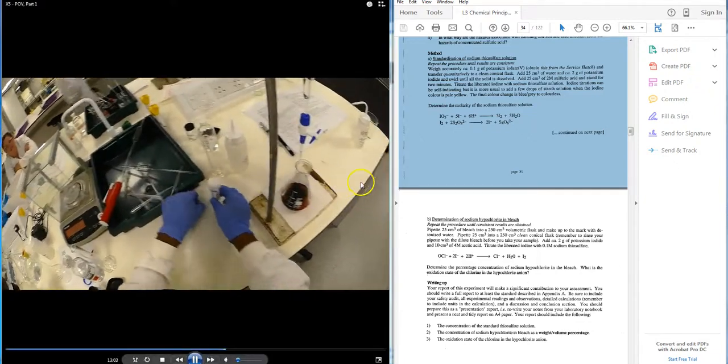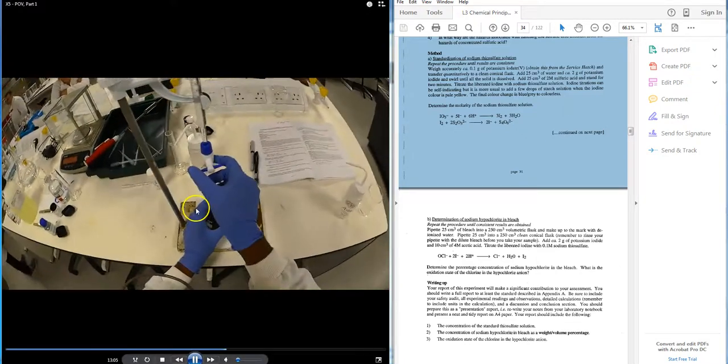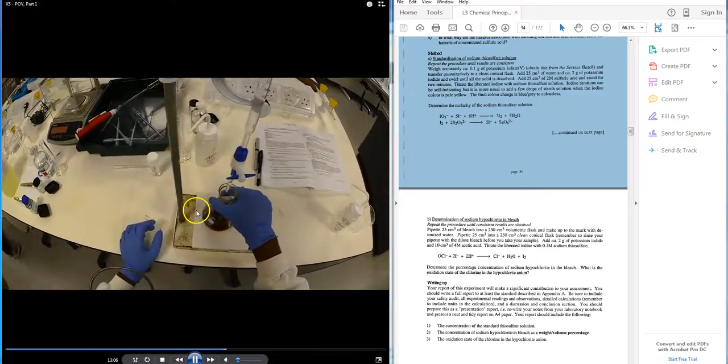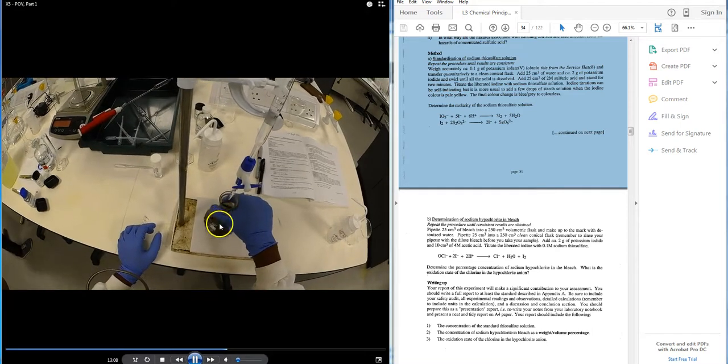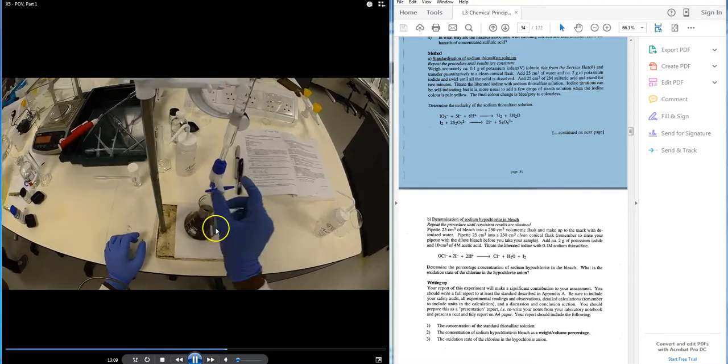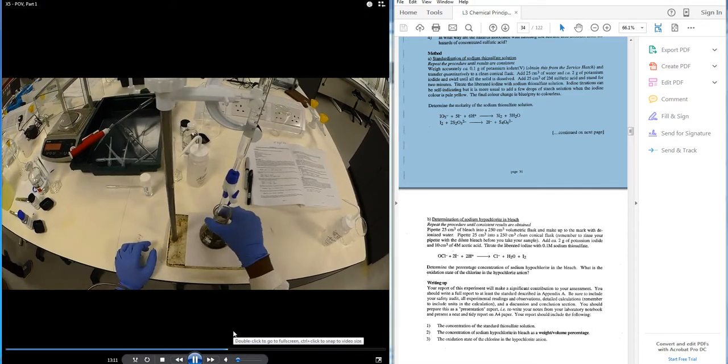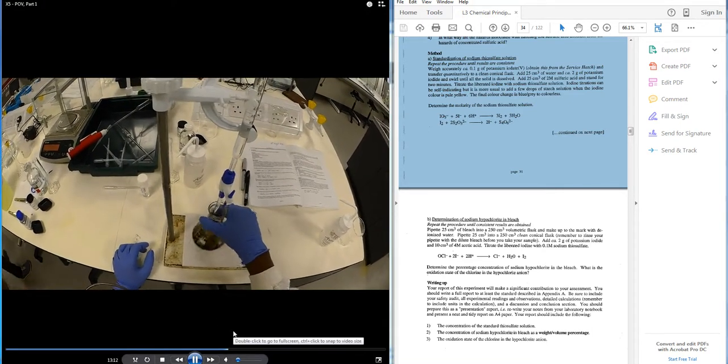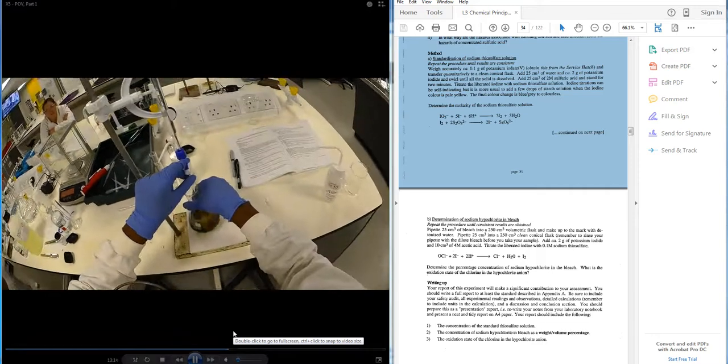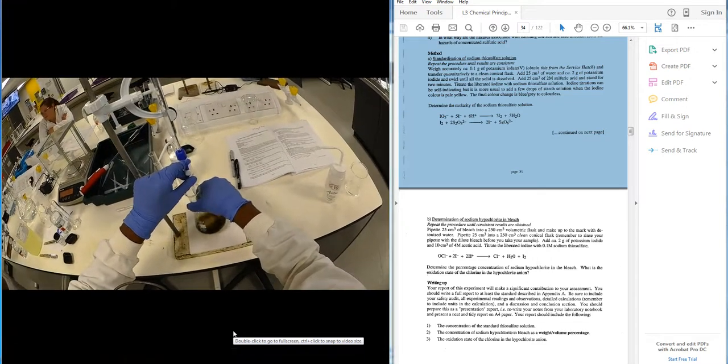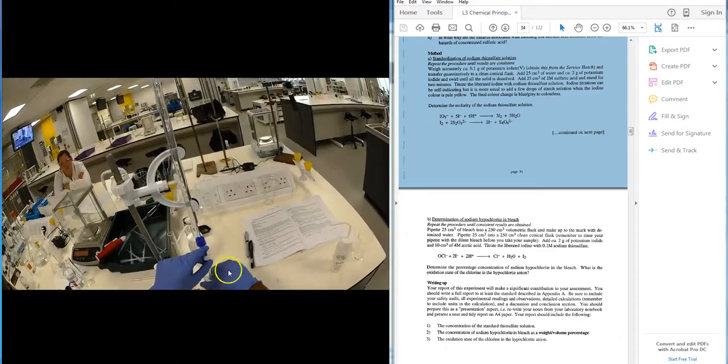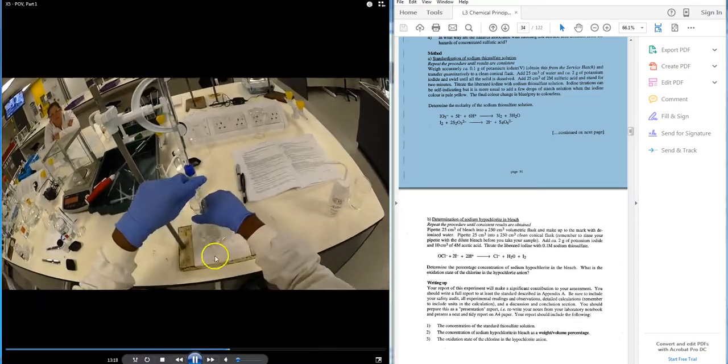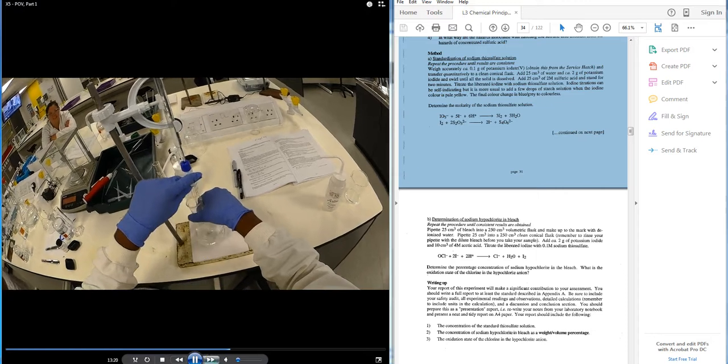And then with a swirl, the student is then going to add some more thiosulfate to discharge towards a colorless liquid. It's got a colorless solution. There you go, it's clear and colorless. So that's what you want.